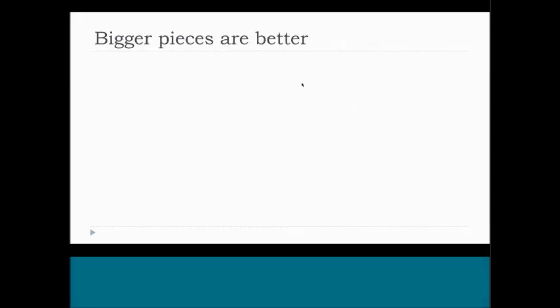And so sometimes I use this analogy of you took the first printing of some book, ran it through a shredder, and you're left with the pieces, and you have to piece the book of the genome back together again. And if you're dealing with, say, short 50 base pair Illumina reads, you know, 10 years ago, some of you might be familiar with that headache. It's like having shreds of paper that just have a single word on it, and it's very hard to find the context of that to then piece the genome back together again from just a single word.